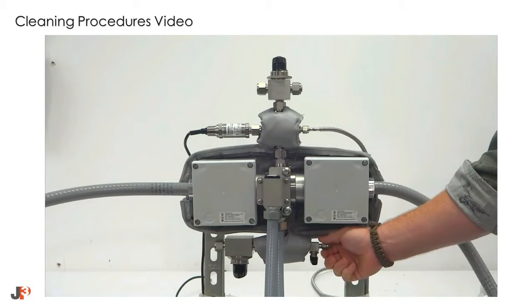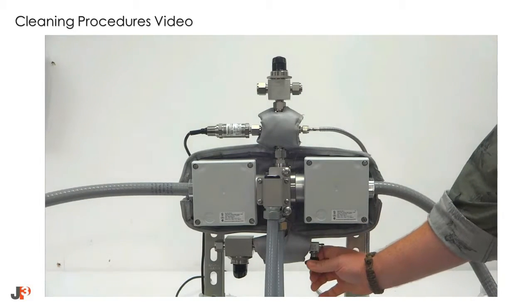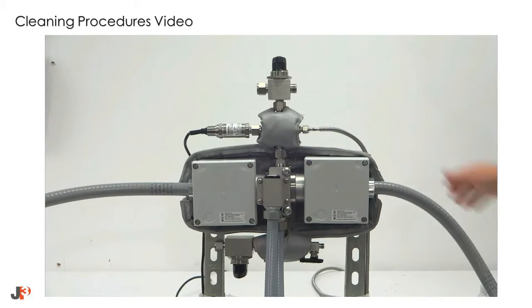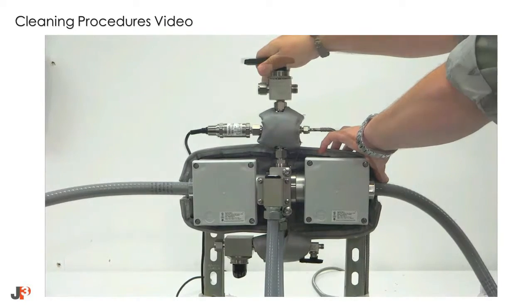The next step is to drain and vent process from the flow cell itself. This can be accomplished using the quarter-inch sample port and the vent side of the three-way valve. Make sure to dispose of any residual process in a site-specific and safe manner.